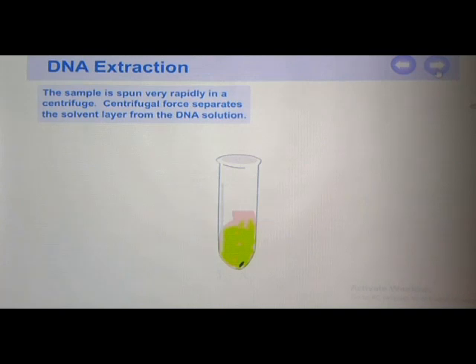The sample is spun very rapidly in a centrifuge. Centrifugal force separates the solvent layer from the DNA solution.